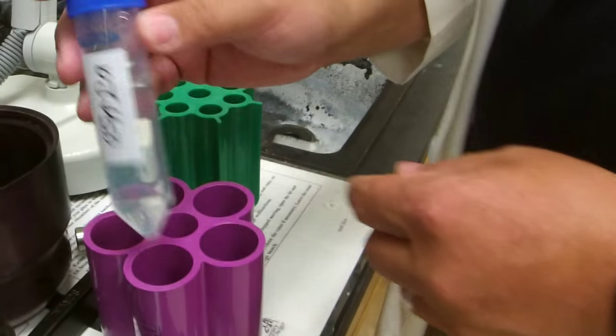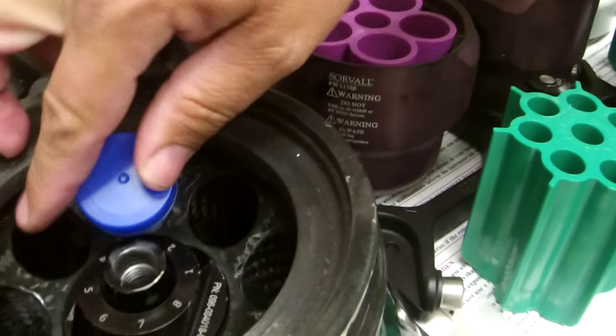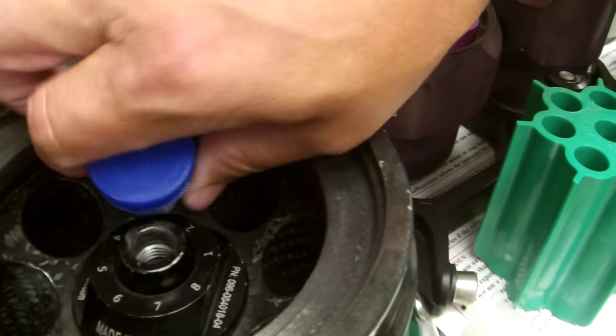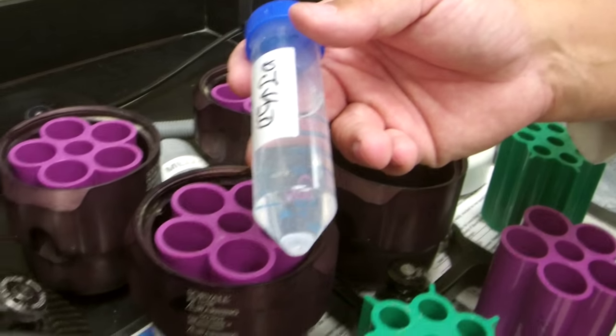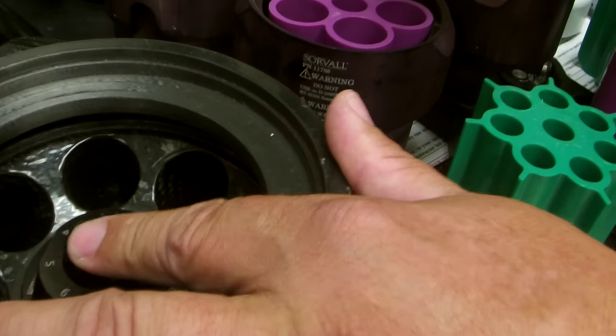These types of tubes can only be used in the correct head. You might try to fit conical tubes in a round-bottom rotor, but never use it that way — they're not supported. The round-bottom rotor tubes are rounded on the bottom; conical tubes don't fit. They will warp and break, unbalancing the rotor, causing contamination and potential breaking of the whole instrument, certainly of the rotor itself.